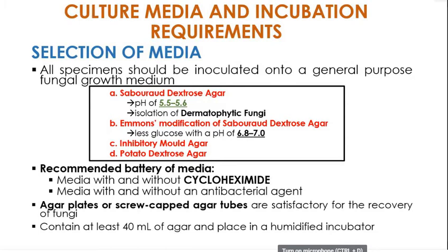Okay. Pag-select natin ng ating media. Now, babalik naman tayo sa agar plate or screw cap agar tubes. If nabasa nyo both books, kasi Bailey's would go for the agar plates. Bakit mas gusto ni Bailey ang agar plate? Kasi mas madali siyang i-manipulate. Imagine niyo, pag nag-open kayo ng tube, ang small ng opening niya. And then, aside from that, ang hirap din ng isolation, ang hirap din i-describe ng colonies na magpo-form sa tube.